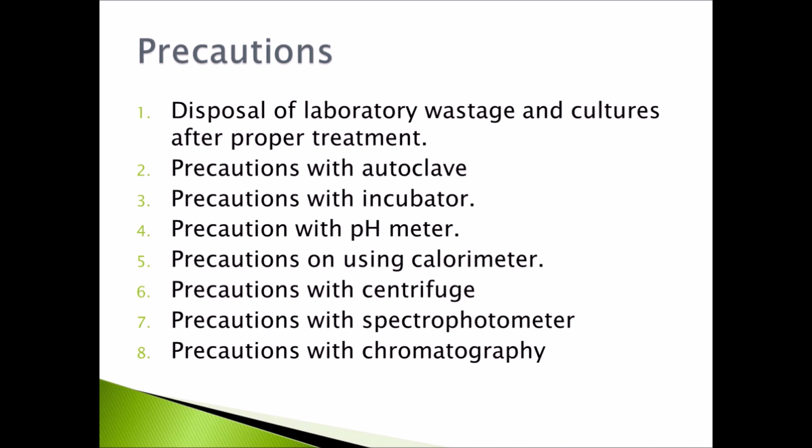Now, about balancing the load, make sure that all samples have the same weight and are placed in a balancing pattern. A small difference can make a large impact at high speed.